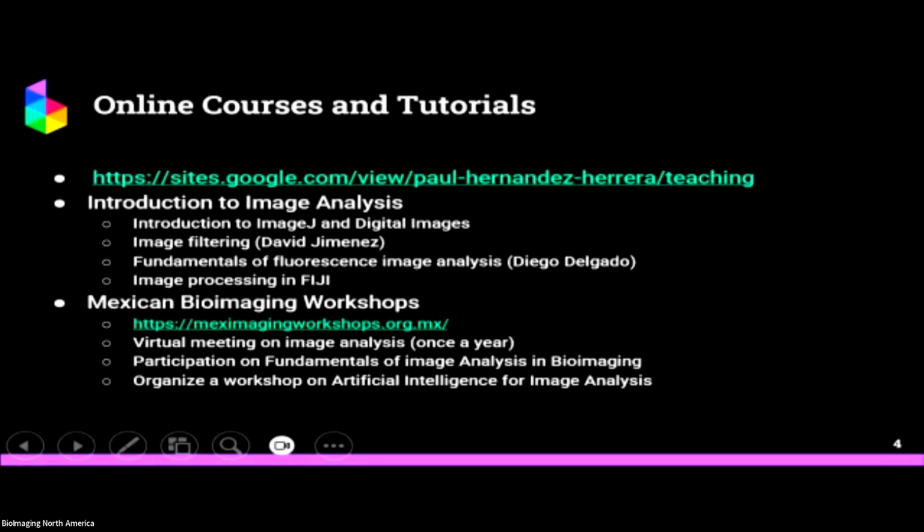If people don't know how to use Fiji, we give a course on Fiji and step by step let people know how to use these tools. It is not for advanced people, it's for people who want to get a feeling on how to use all these tools. In this course, Introduction to Image Analysis, we give topics related to digital images. I work with some other friends, and he gave some other topics: image filtering, fundamentals of fluorescence, and image processing. That was only the basics of Fiji, just to get the feeling of how to use these tools.